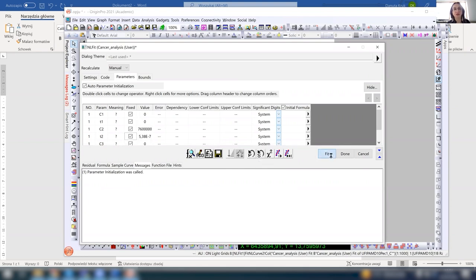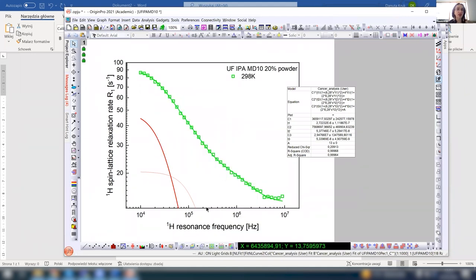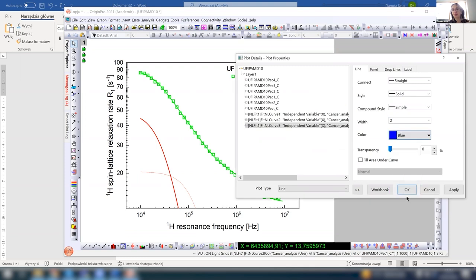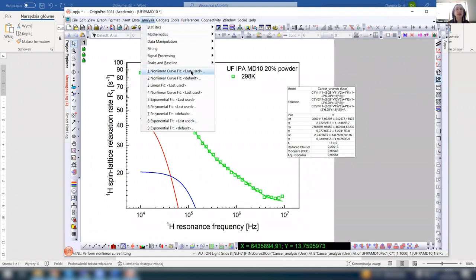Simpson fit. Yep. This is what we somehow talked about previously, whether there would be a chance to get rid of such a contribution. At this moment, we have it, yeah? It's not so small, not so big, this is the intermediate one. But this is something to think about, what was said previously, that maybe one could attempt to have a fit including only 2 contributions. But let us try further.